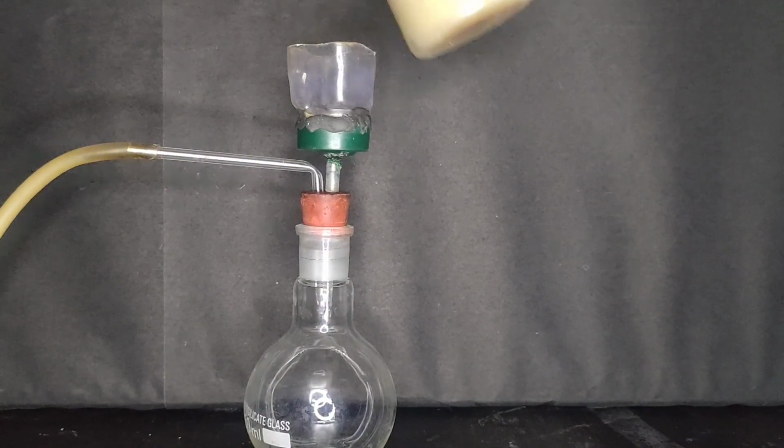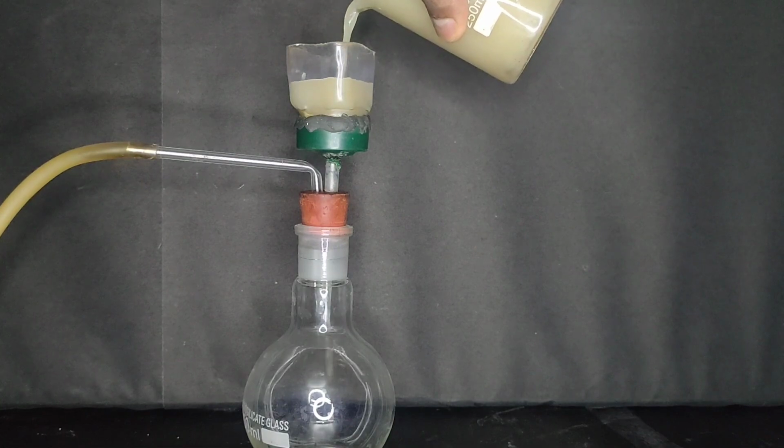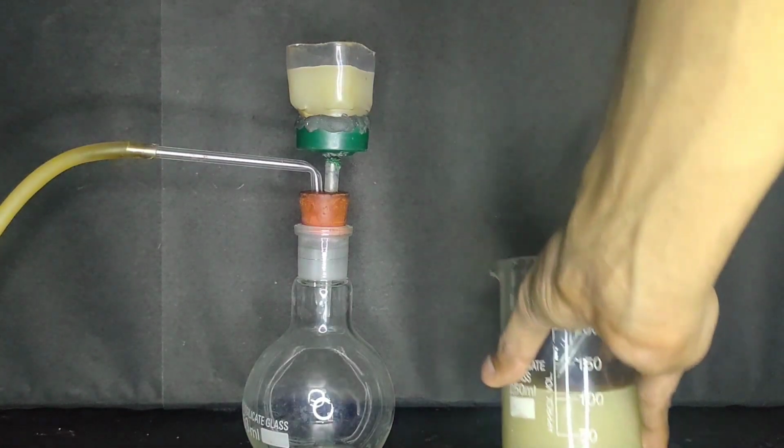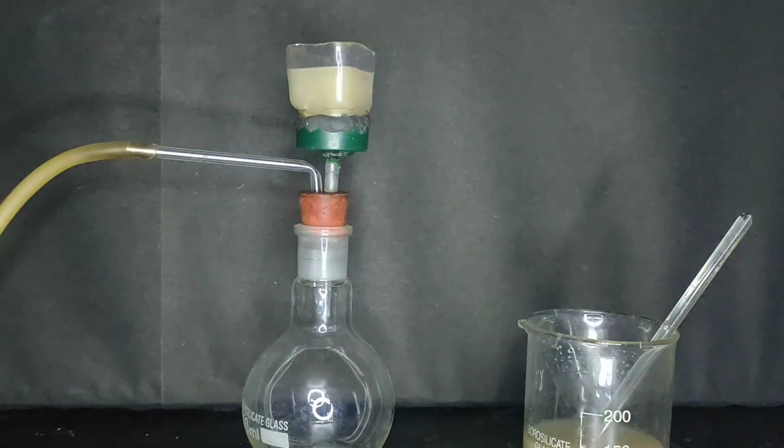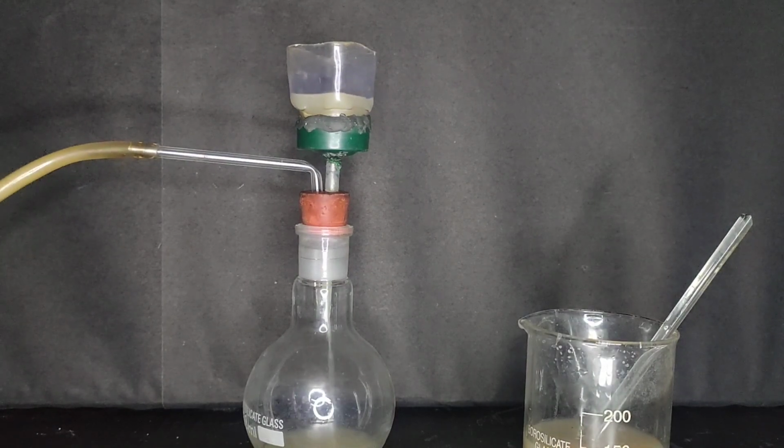filtering it. Usually on adding acid to a naphthoxide solution, we get a precipitate which can be easily filtered through filter paper, but in this case I got a colloidal solution which was passing through the filter paper without giving any residue. So like that, I could not get any alpha naphthol.